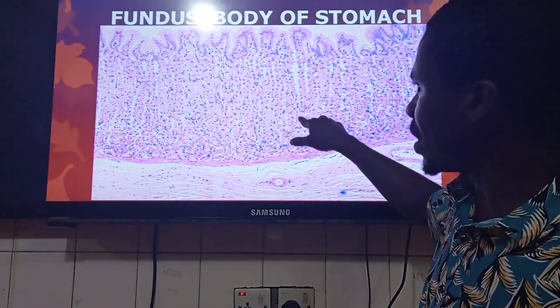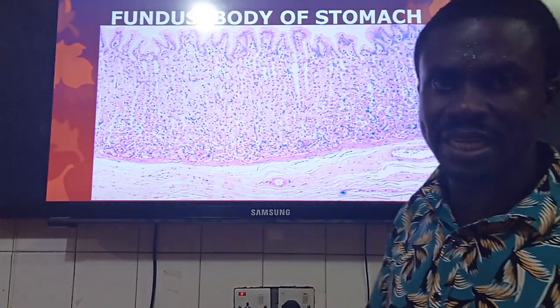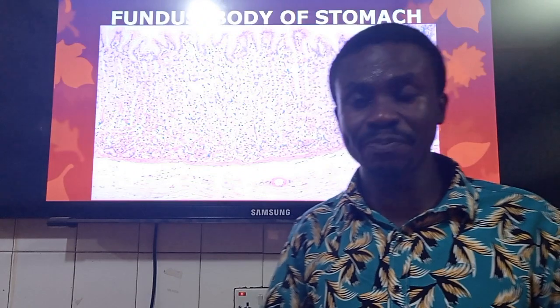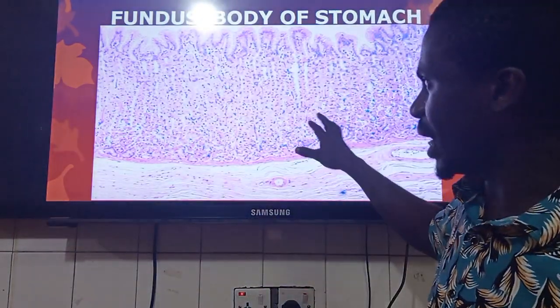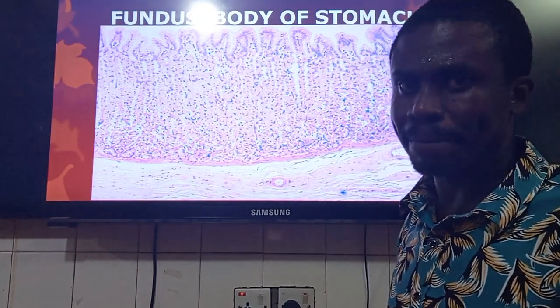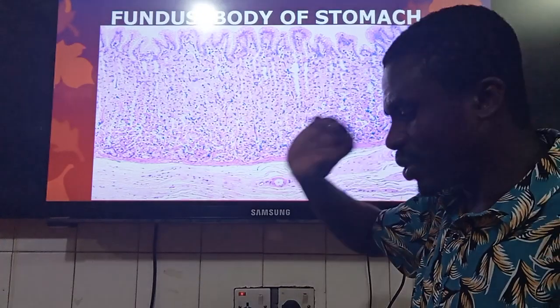And then we'll have basophilic nuclei, no problem. And then there will be a few cells having basophilic cytoplasm. Those which I'm saying are numerous, with eosinophilic cytoplasm, are the oxyntic cells or the parietal cells of the stomach. And the basophilic ones will be the chief cells, or the peptic cells, or the zymogen cells. That is one thing that we see. The same thing applies to these.